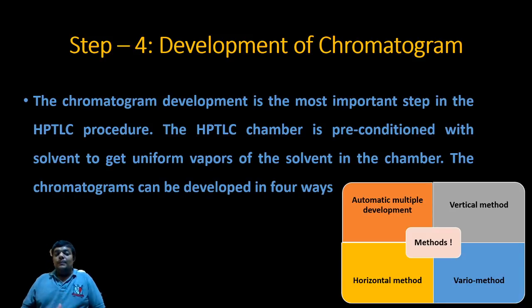The upcoming video has a little low voice, but over there also the voice is not important. Important is the mechanism, the mechanical work that is being done, and where needed I am pausing the video and going to explain. So do not worry, enjoy the development of the chromatogram.